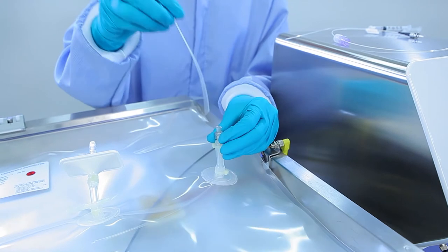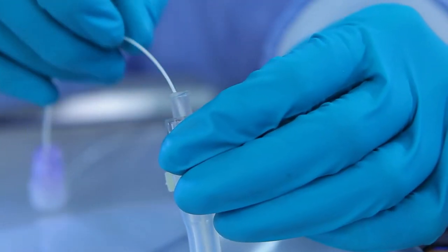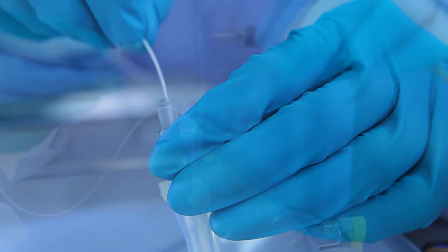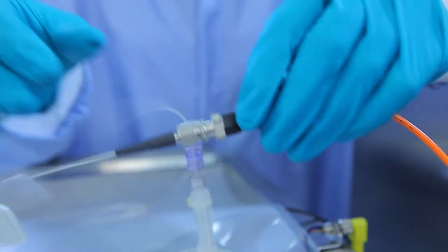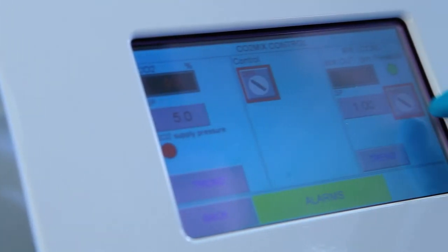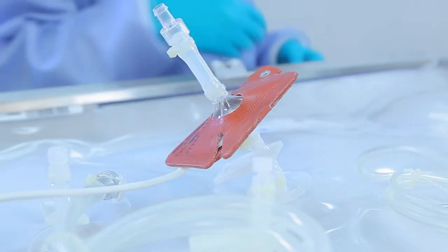Before inserting the optical DO probe, fill the insertion port with distilled water. Connect the probe to the WavePod 2 via the optical connection. The zero oxygen calibration is performed prior to inserting the probe in the insertion port.